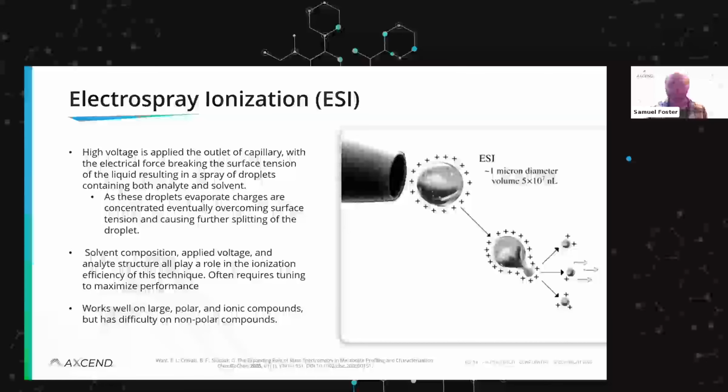Now we'll get to the most popular one, which is electrospray ionization, or ESI.